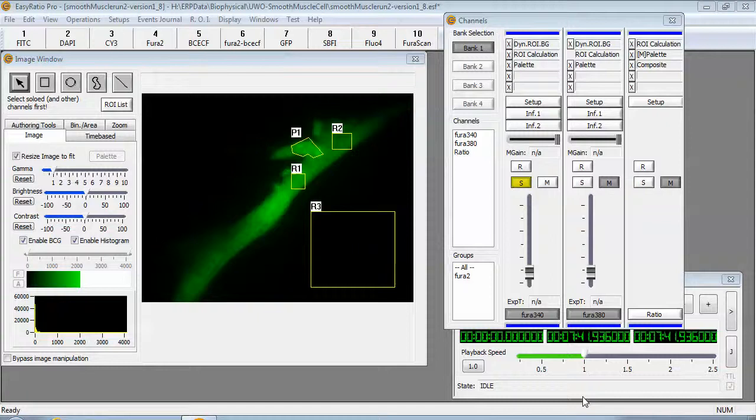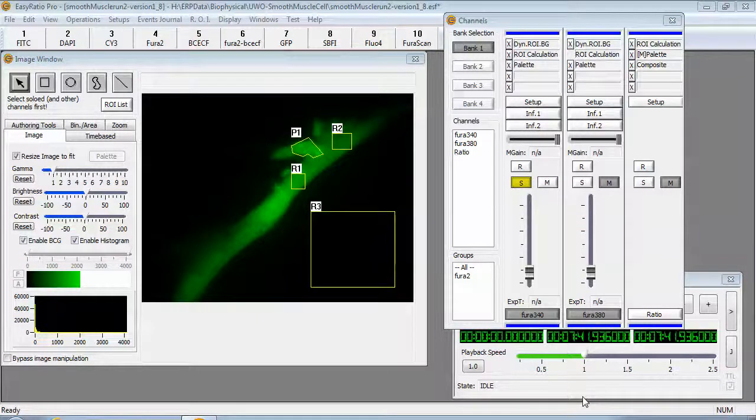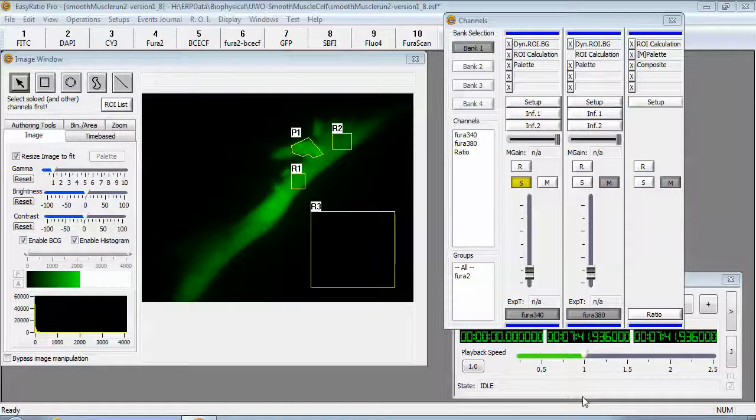Hello viewers, thanks for joining this tutorial. In this example I'm going to show you how you can export images to the Metafloor format.